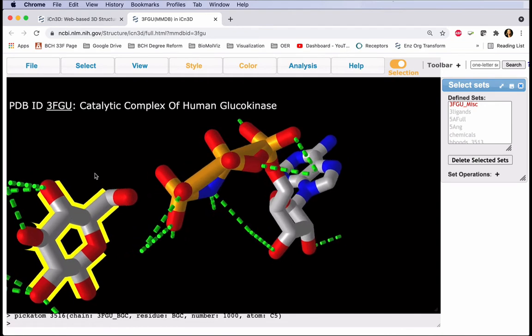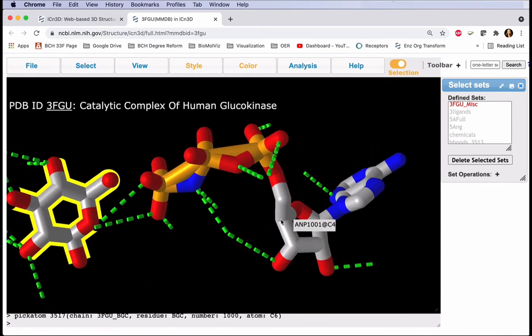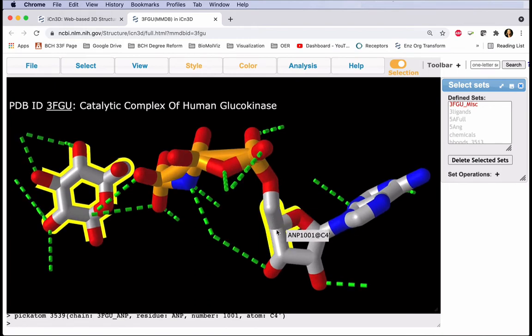And we only want carbon atoms, so we may have to reorient. And we'll do the same for our ANP ligand.